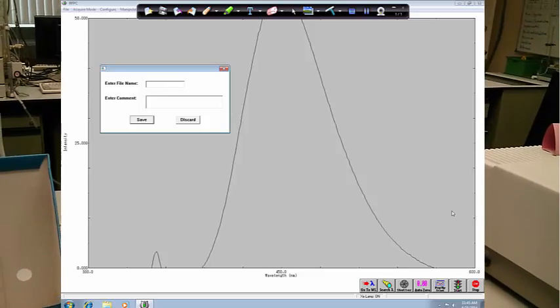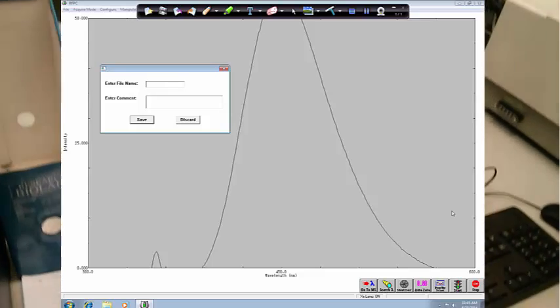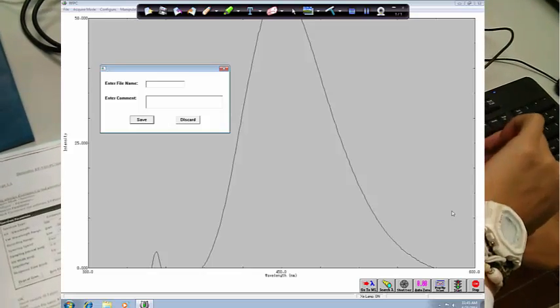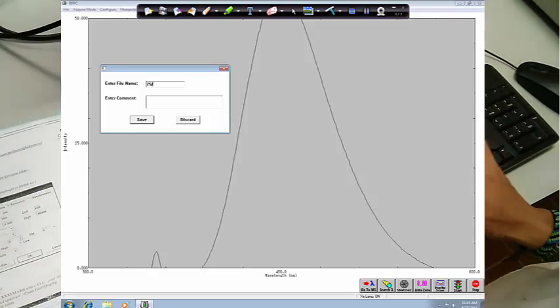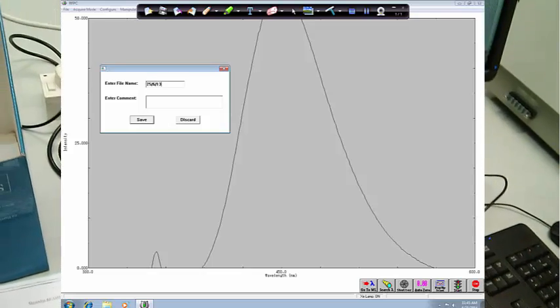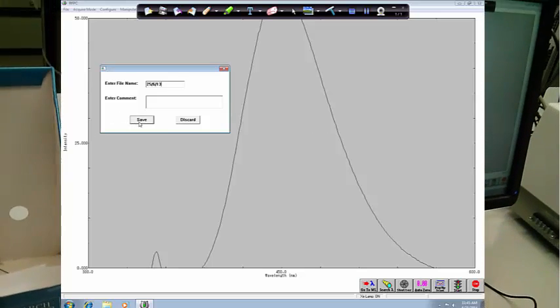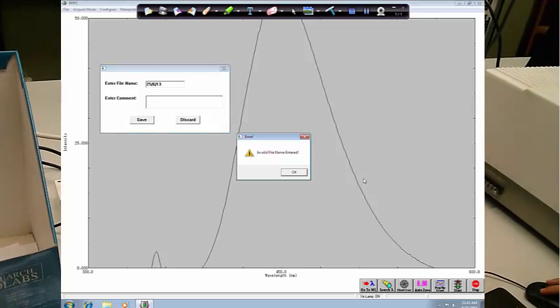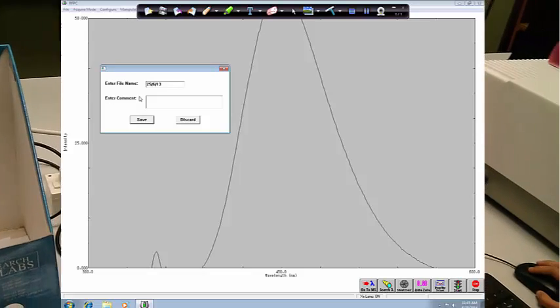In here you'll enter your file name. I'll just put the date today and save. Ah, it doesn't like slashes. Make it one number.